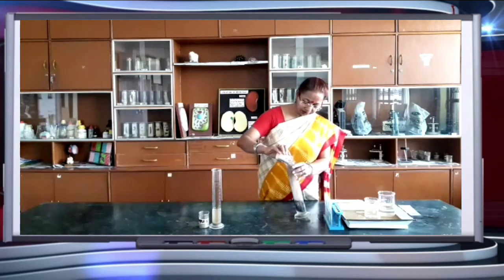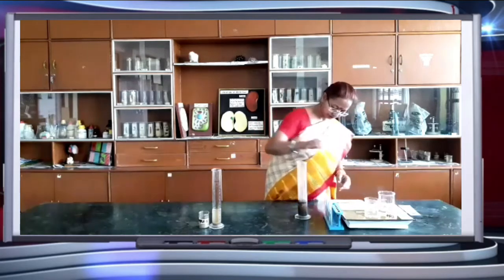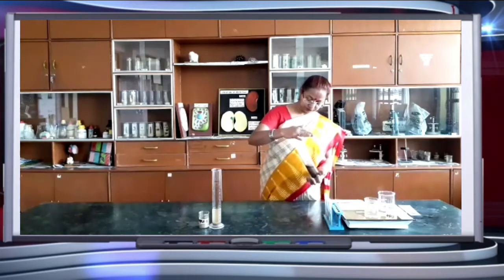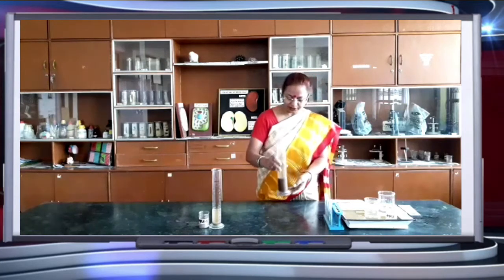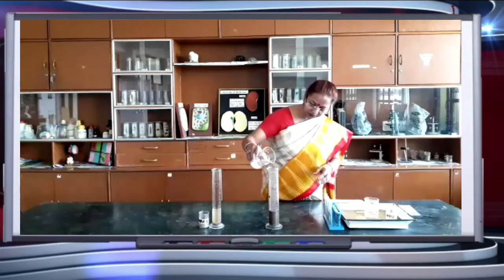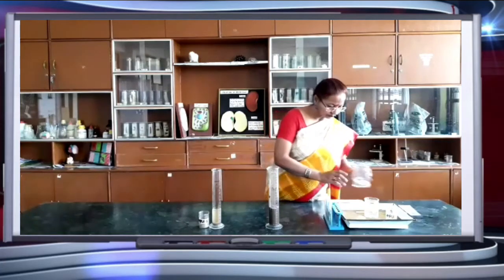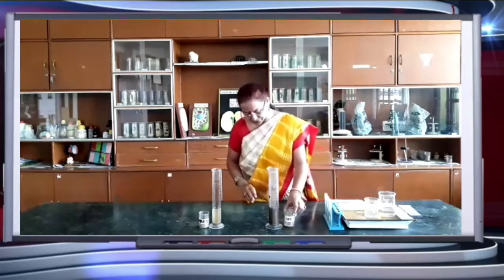This also I am adding in this measuring cylinder. Shake it well and leave it for some time. We can add a little more water. This is sample 2.